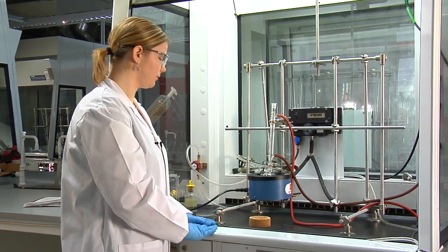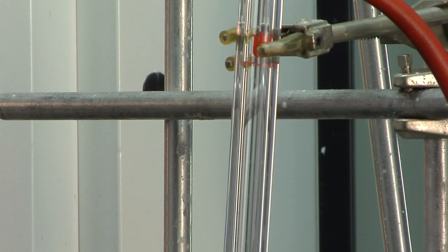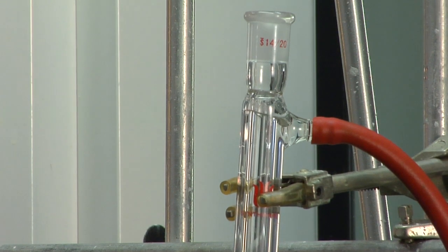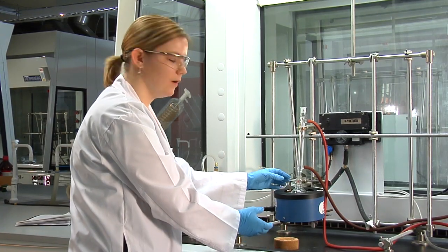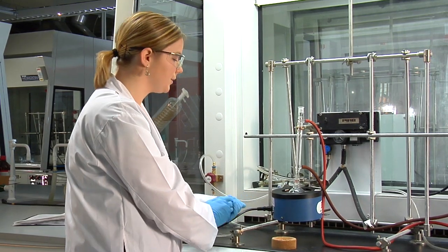If the heating is going too fast and you're not able to bring the temperature down fast enough, then what we can do, because we've set this up on a ring clamp, is we can lower the ring clamp and bring the heating mantle out so that we can bring fresh air in around the round bottom flask.